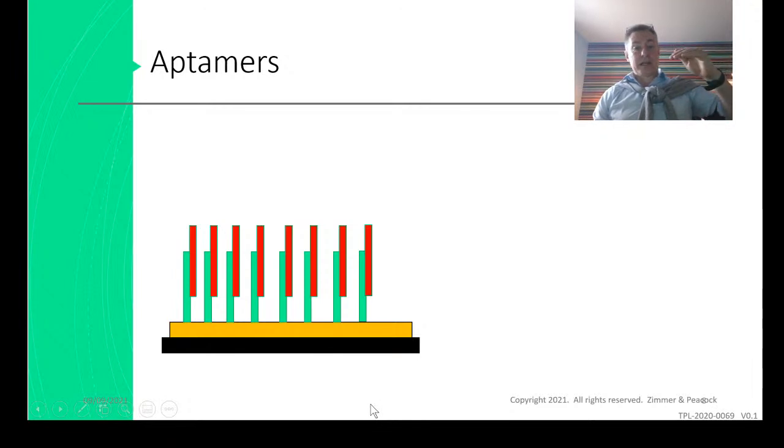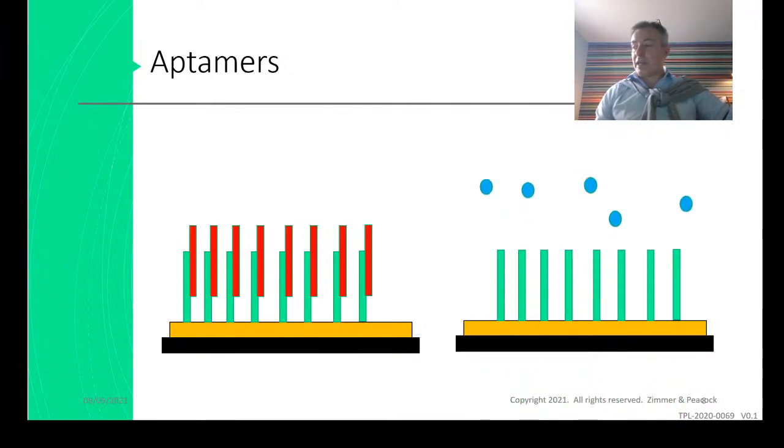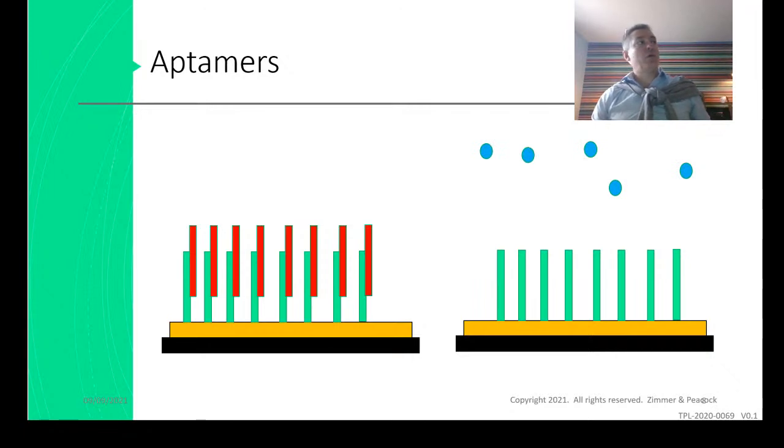So Phil says, I have an electrode, I put my aptamer on it, there's a good change in impedance, I then put my target on there, there's not a good change in impedance. So Ali has been trying to advise him, and it comes down to you have to optimize it. One of the things that struck me, I wondered a little bit, is whether he's taking his electrode, putting his aptamer on there, and then he's not putting a reporting molecule in there. He's relying on the intrinsic conductivity of his buffer, but there's nothing active in there that would be his source of signal. And the reason I say that is because maybe he's got his aptamer down there, he goes into a high impedance region, and then he puts his target on there, and he's basically just moved from one high impedance to a slightly higher impedance. And I wonder if he wants to have a stronger signal.